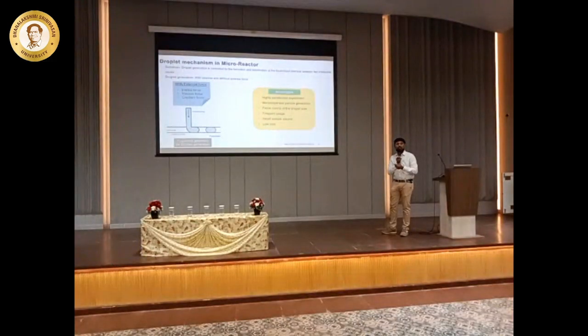Say for instance, I change the syringe pump flow rate. Definitely I can also change my particle sizes. If I increase the concentration, I just need to change the parameter of the syringe pump flow rate. That's external, that I'm going to add. That's all. So I can do everything depending on my need.